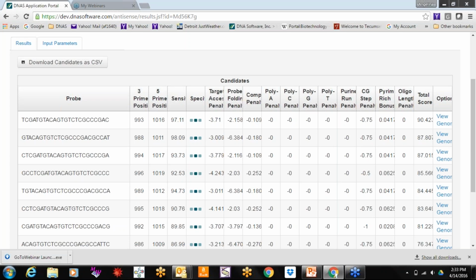That's why we weight the C's and the T's as higher, because they're more discriminatory when it comes to mismatches, and more discriminatory when it comes to actually matching. So it just helps when you're working toward increasing your specificity.